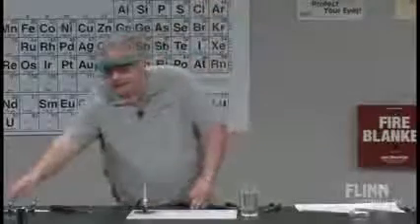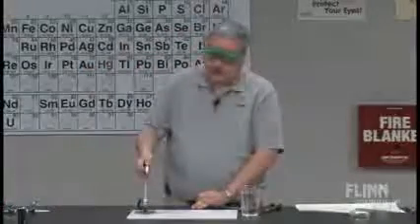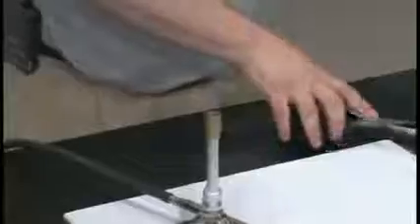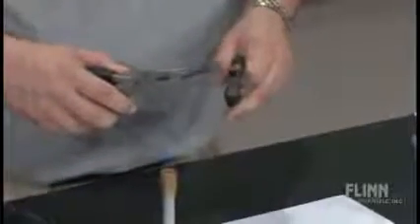So let's turn on the Bunsen burner flame. Remember, this flame, when it's optimal, is nearly invisible. And so you have the flame, and you can see that hot part of the flame as the inner cone. So what I'm going to do is take these 2 pliers and just hold it in the flame. And I'm just going to hold it right there.